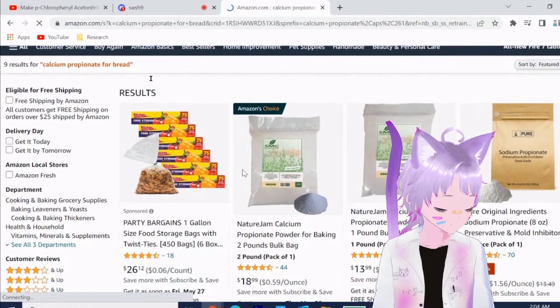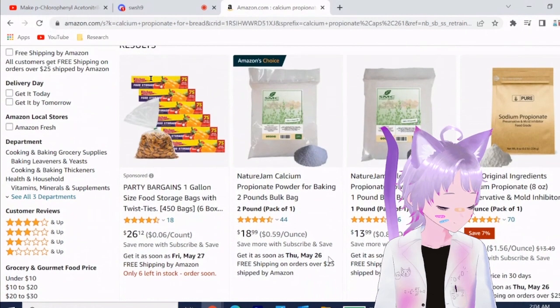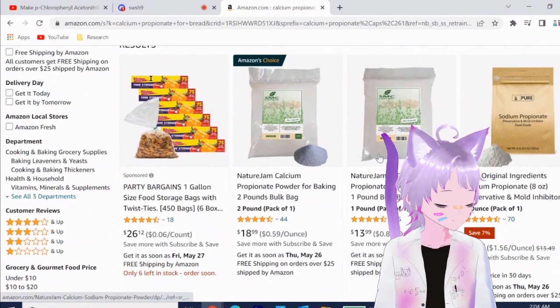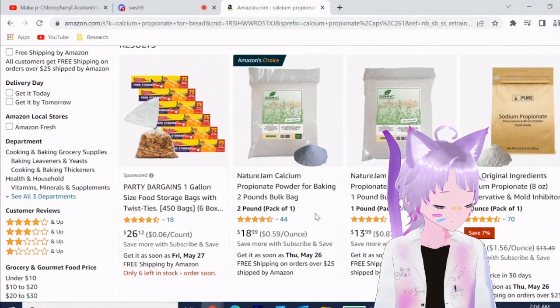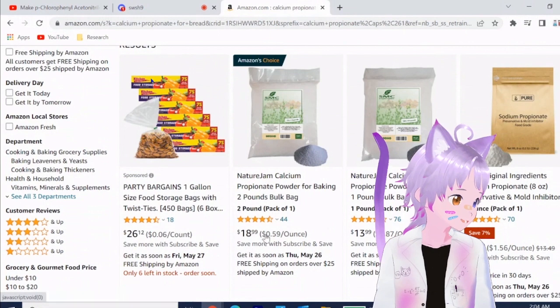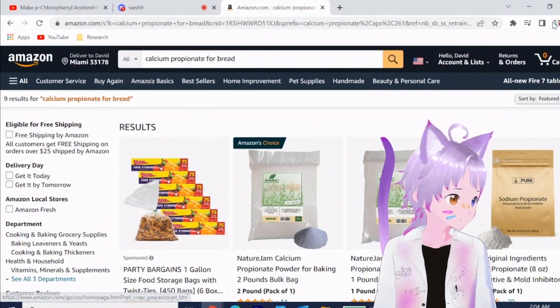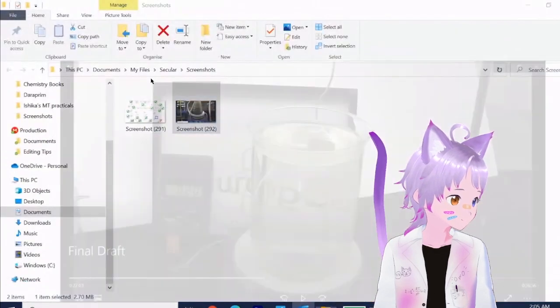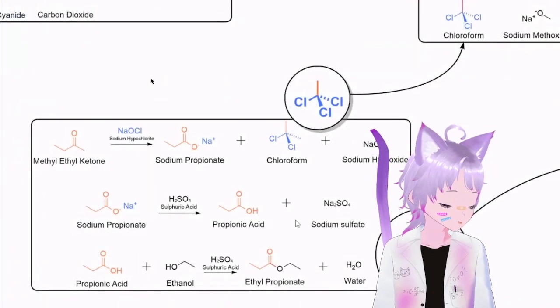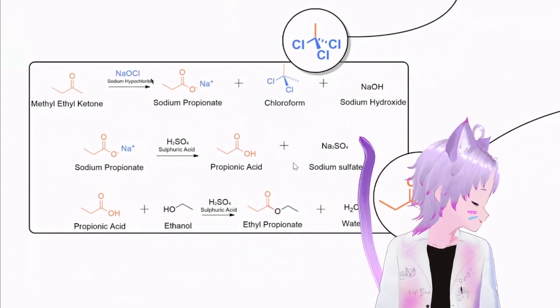Calcium propionate for bread. And they sell this in huge bags, actually, which is really good. So this would be my source of propionic acid, but I'll just convert it to sodium propionate and then react that with sulfuric acid. That would be my step for propionic acid, basically. So you're just gonna buy calcium propionate, then you don't even need to use methyl ethyl ketone for this step.